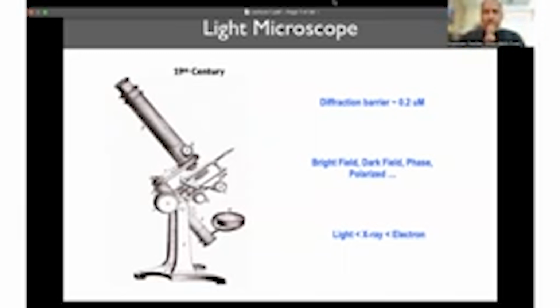It's something that allows you to be able to separate two objects as being two distinct objects, provided the beam of light, or in some cases, X-rays or electrons, if you're using an electron microscope, is able to distinguish between these two objects as being two distinct objects, right?